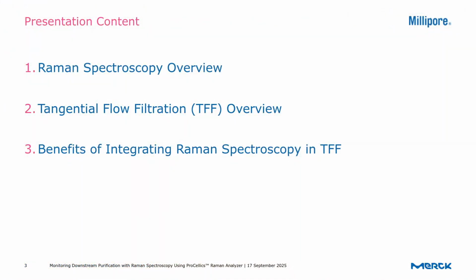My content for today will be broken up into three sections. First, I'll be giving a background on Raman spectroscopy. Next, I'll give an overview of tangential flow filtration at a high level, and then talk briefly about the benefits of integrating Raman spectroscopy in TFF before passing it off to our next presenters, who will be giving a more in-depth look at their specific unit operation and step of interest.